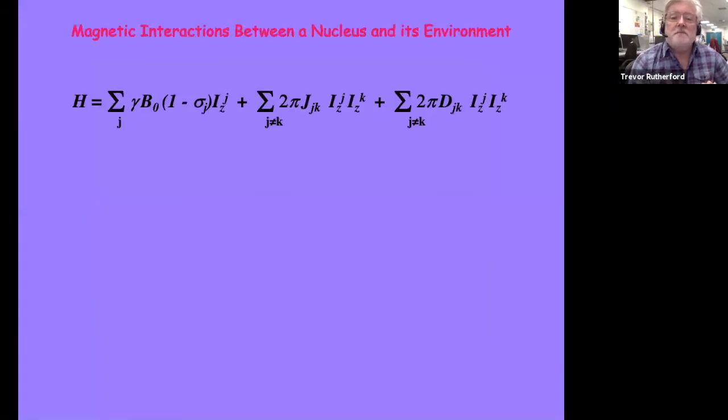Okay, so what I wanted to do then is, as I said at the beginning, we will look at the very first principles of what NMR is about. Where does the signal come from? We've just had a look at that, but in what ways does this signal interact with the molecule? And the nicest place to start, I think, is looking at the Hamiltonian operator, the nuclear spin Hamiltonian for the NMR experiment. Now, this isn't put in to put people off with physics. This is put in actually to show how simple the expression is, okay? So this isn't trying to highlight complexity, it's exactly the opposite.